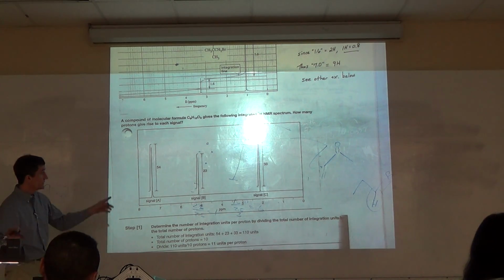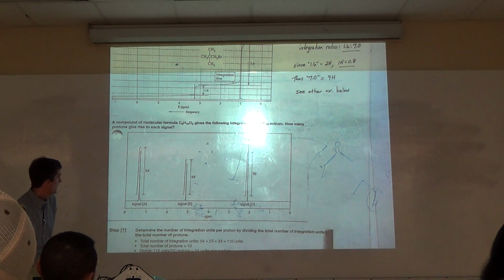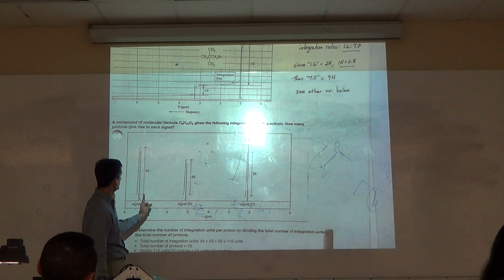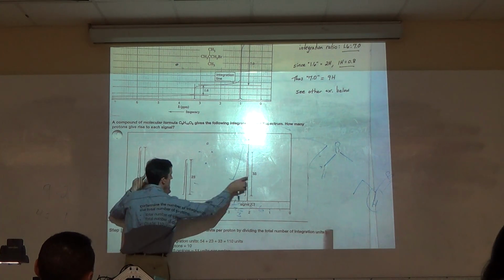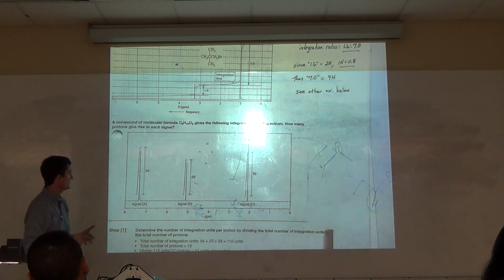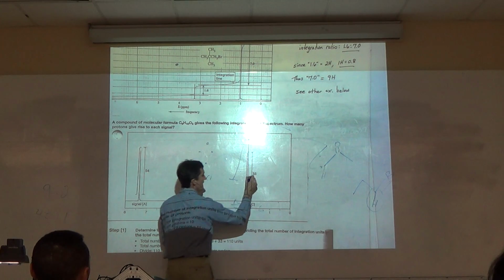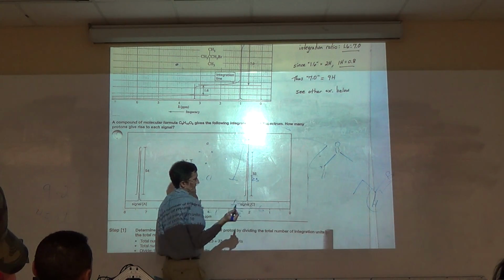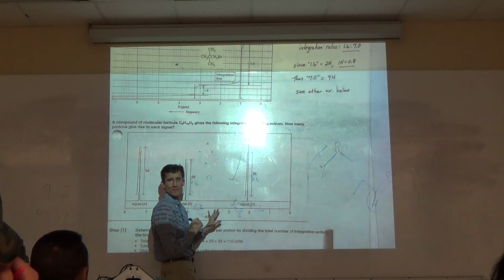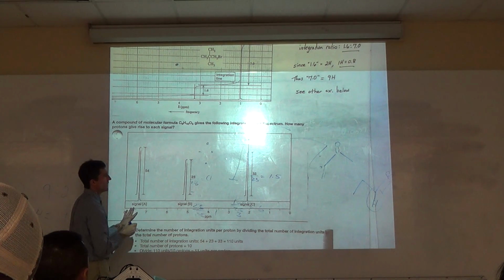Okay? Let's look at the one down here. This is an integration. It's some arbitrary number. We've got to boil it down to a ratio. We can do that by dividing this by 23. Get 1. Divide that by 23. What do you get? Approximately? That's like 1.5, right? Well, guess what?